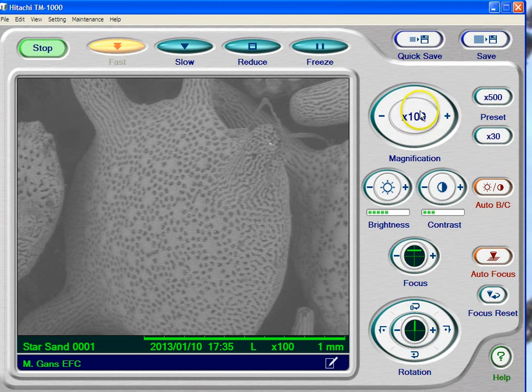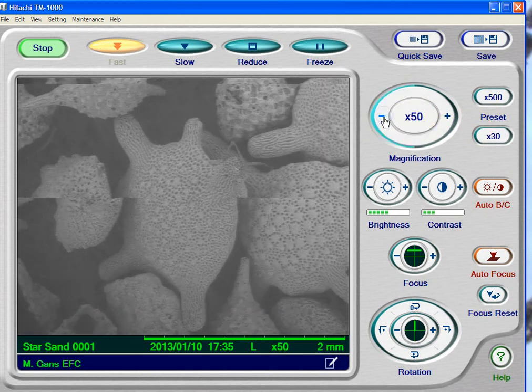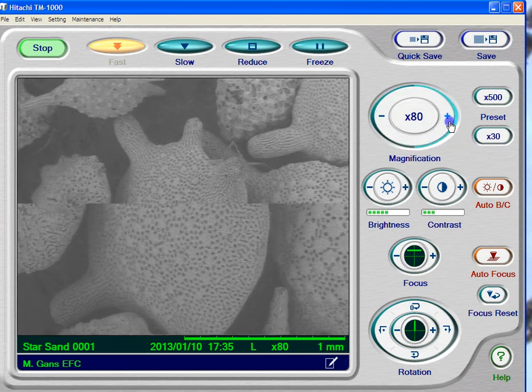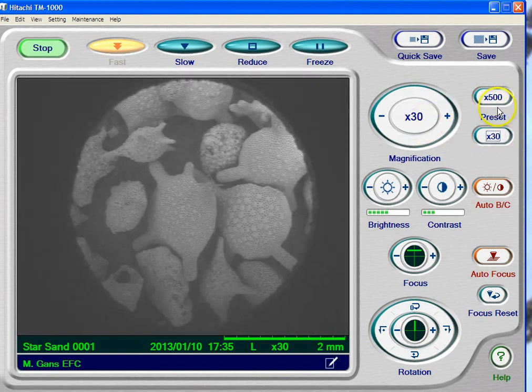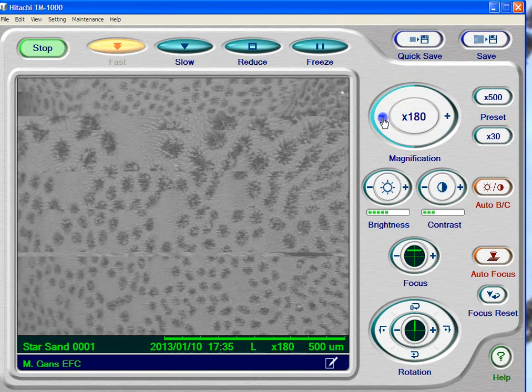This number right here tells you the current magnification. I can decrease it by clicking the minus — you can see that I'm zooming out. I can increase it by clicking the plus. We also have a couple of presets, just ways to quickly change magnification. If I click on the 30x preset, it goes to 30x. If I click on 500, it goes to 500. Let's put that back on 100.